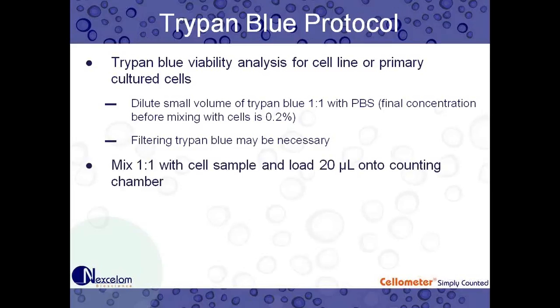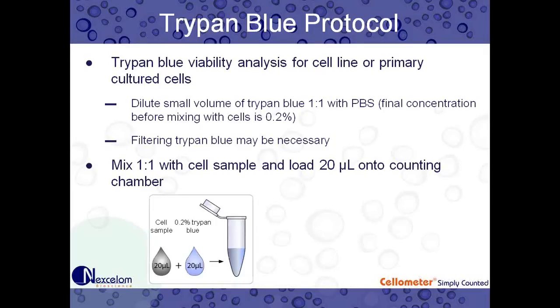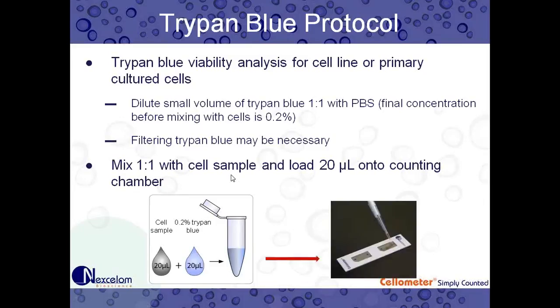Next, we mix one-to-one: take 20 microliters of our diluted Trypan Blue and mix that with 20 microliters of our cell sample. Then we load 20 microliters onto our counting chamber. So: 20 microliters cell sample, 20 microliters Trypan Blue, and we load our counting chamber to get ready to count.